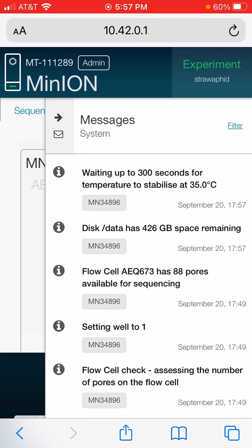I'm going to open this up. It says it's waiting up to 300 seconds to get to 35 degrees Celsius. Hopefully it gets up there because it's starting to get cold out here. I'm not sure what it'll do if it doesn't ramp up to that temperature.